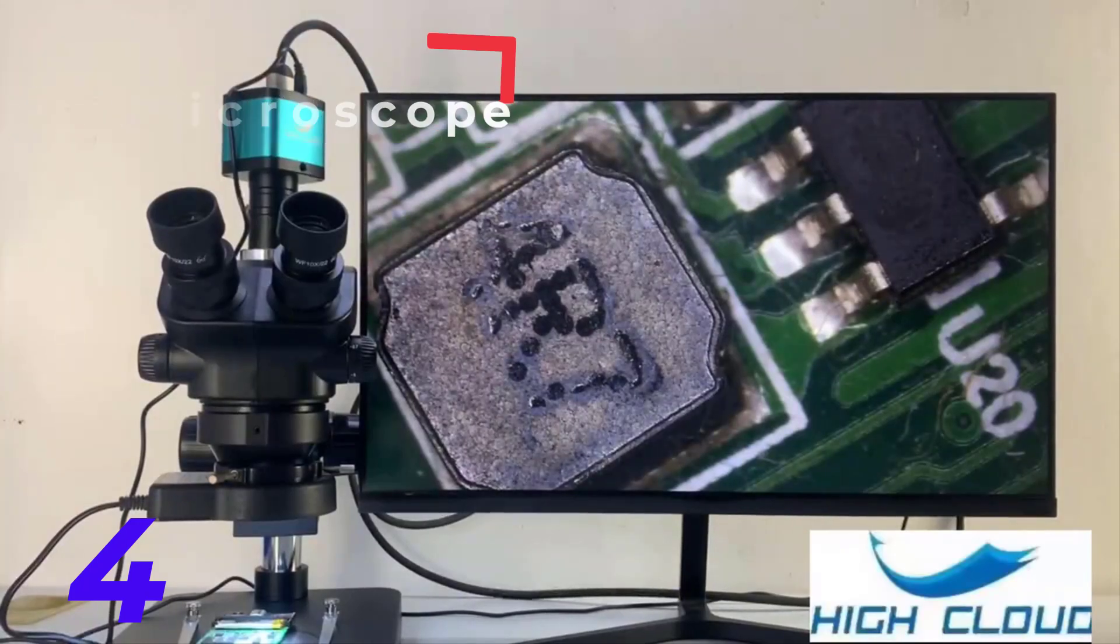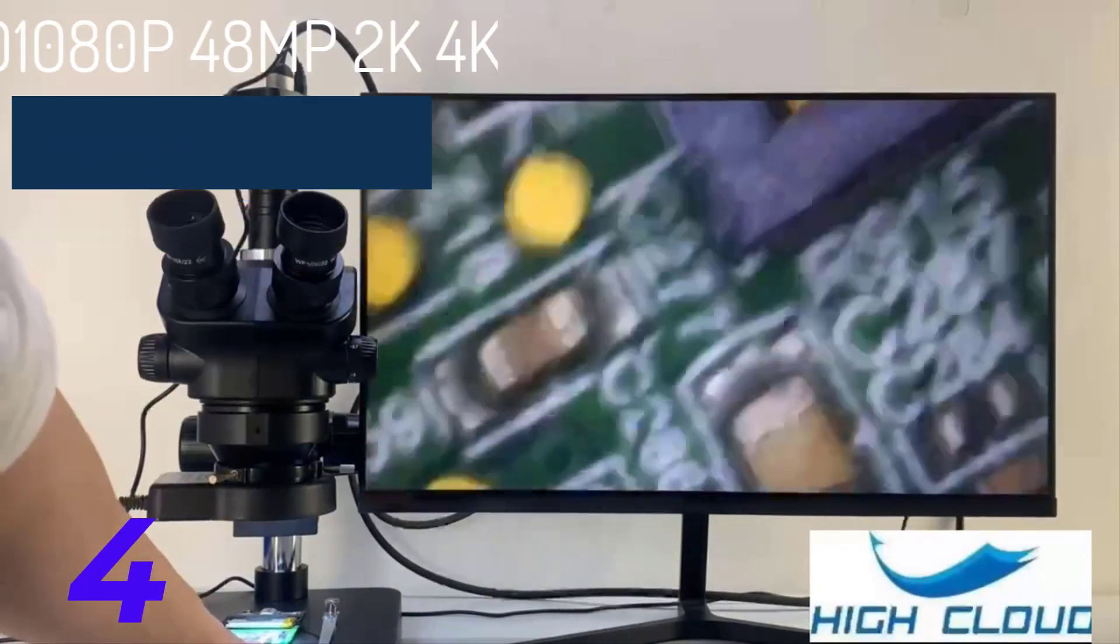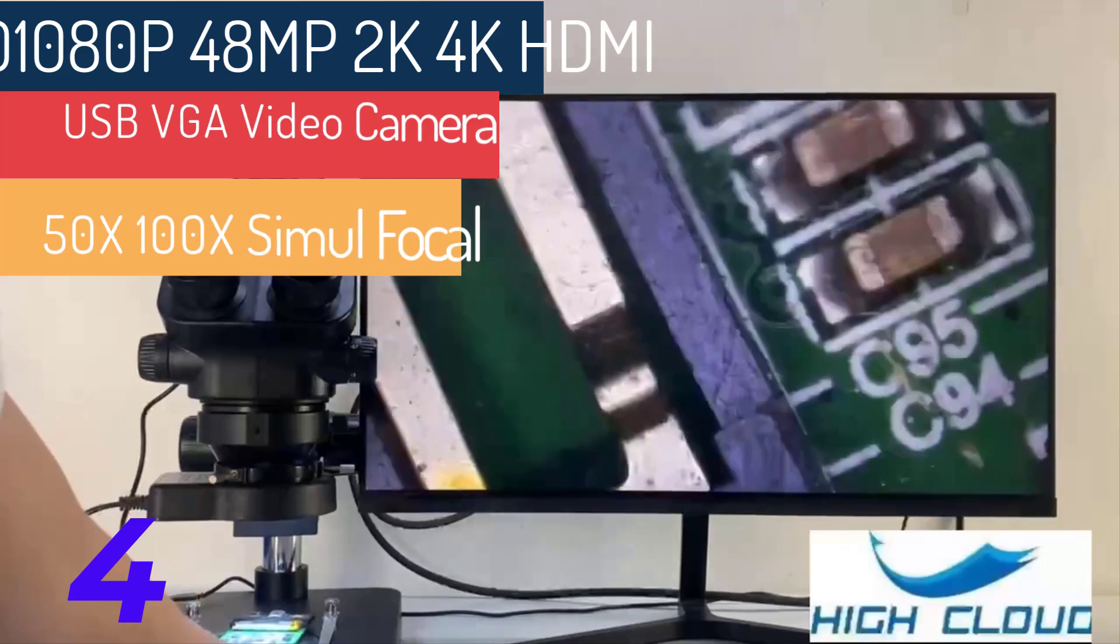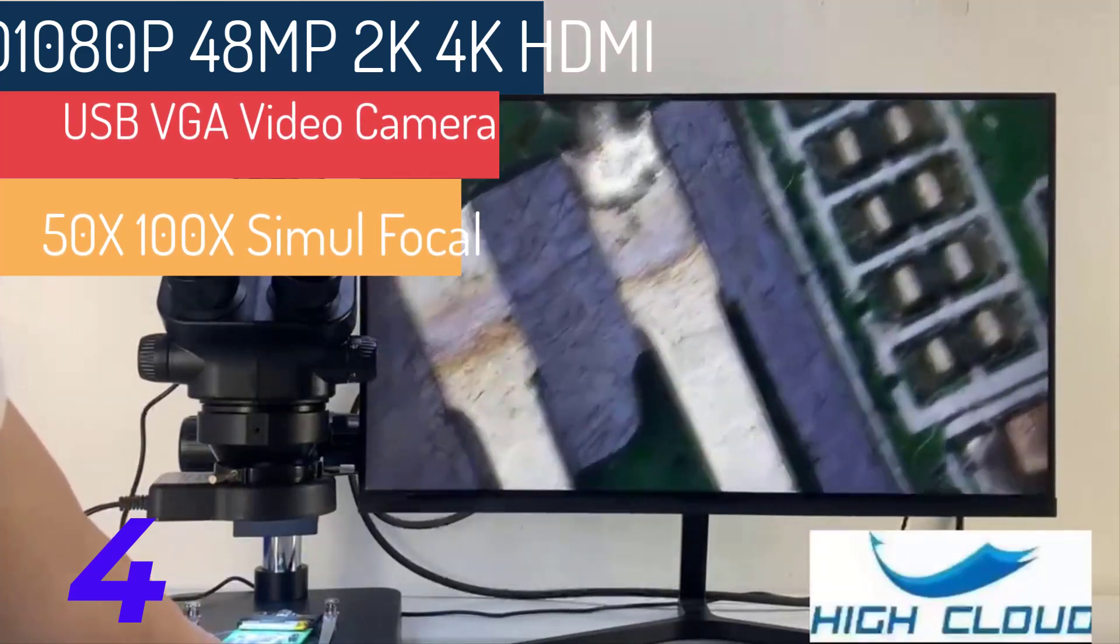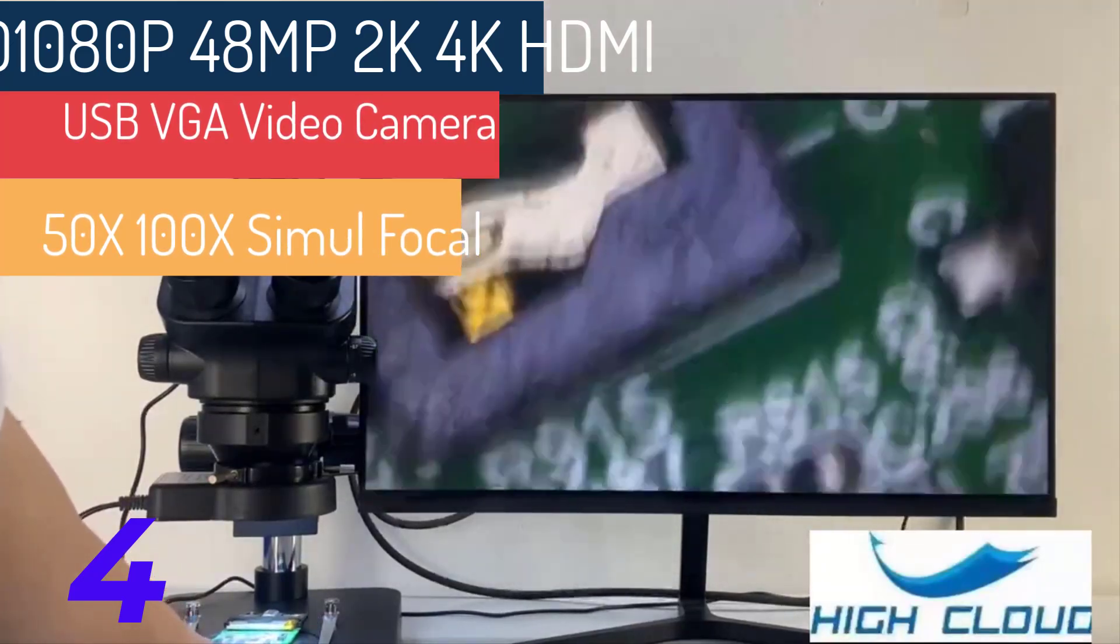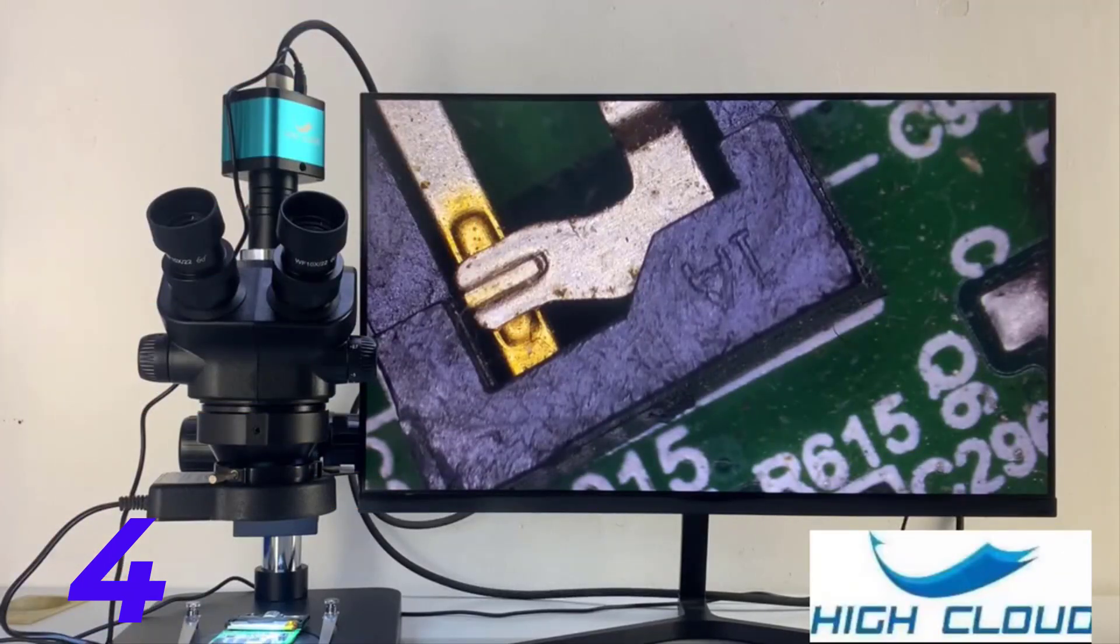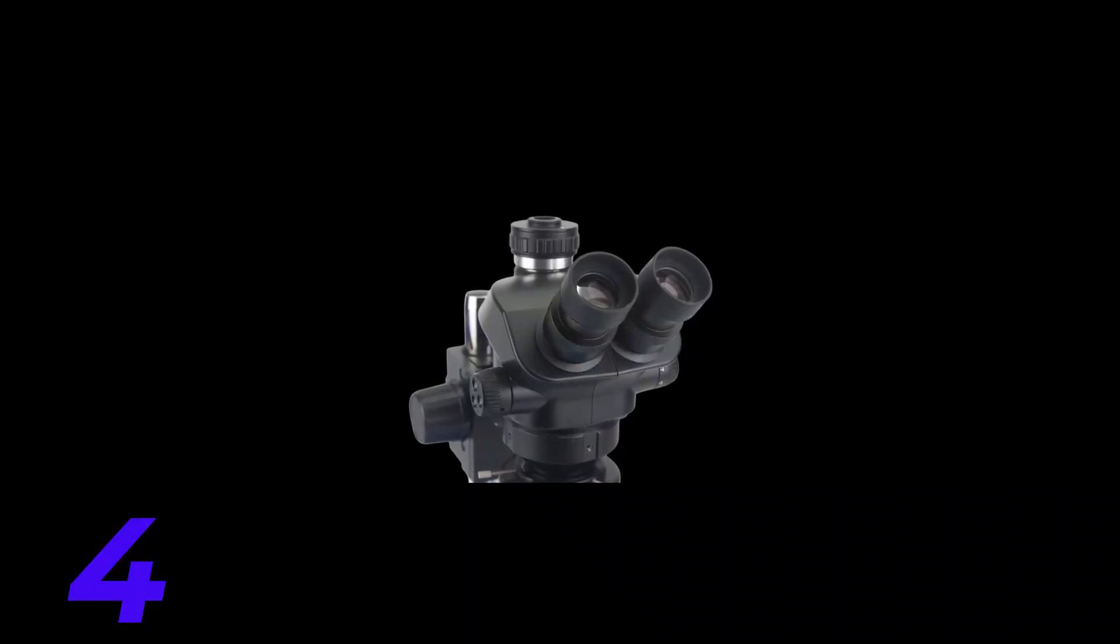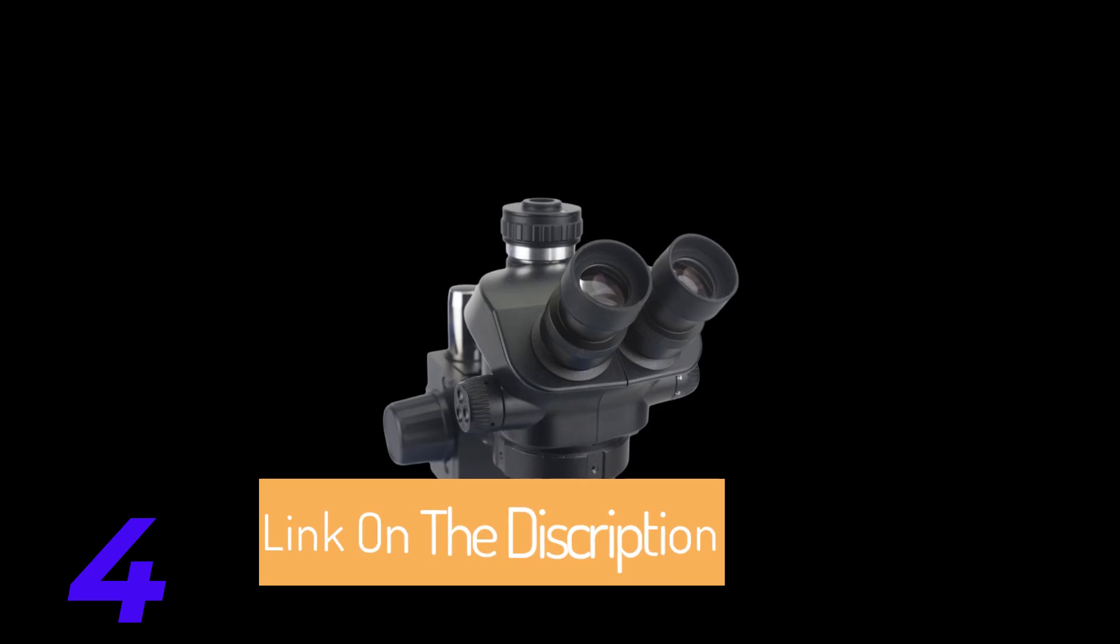The microscope set boasts an impressive 48-megapixel camera capable of capturing stunningly detailed images and videos in resolutions up to 4K. This high resolution is crucial for applications requiring precise visual clarity, such as electronics repair, biological research, and material inspection.